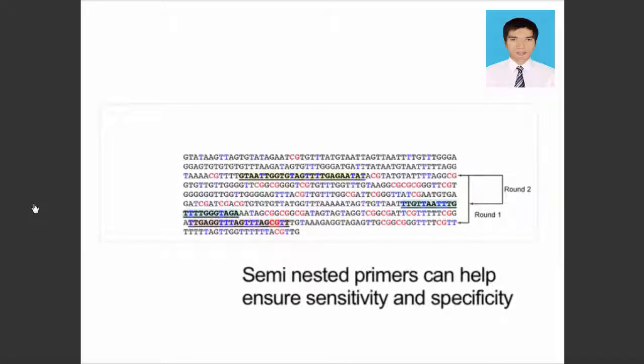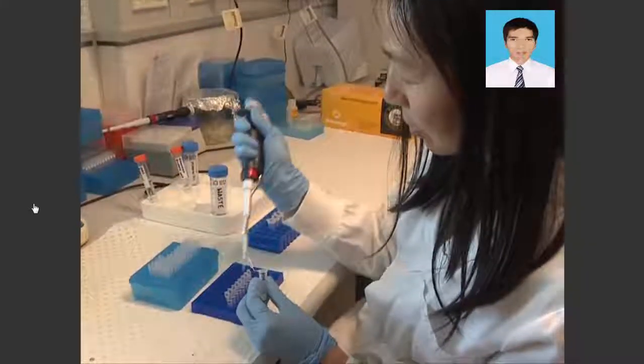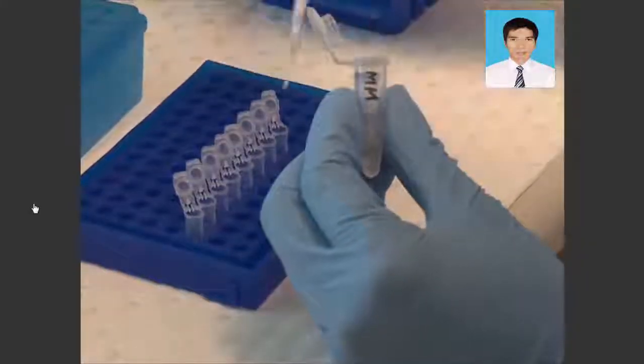Finally, design nested or semi-nested primer sets to ensure specificity or sensitivity of the PCR reaction if required. Prepare PCR amplification reaction mixtures in 25 µL aliquots for optimization.